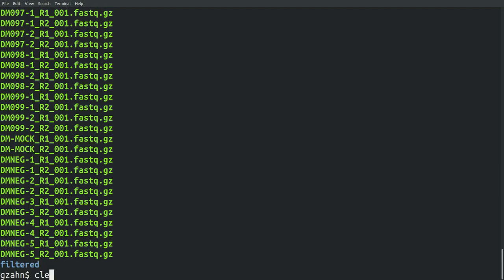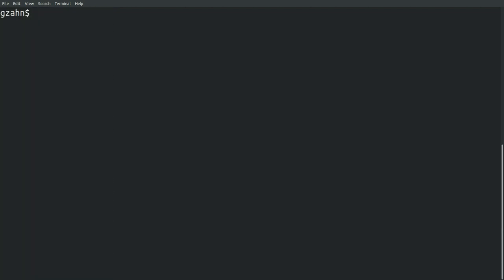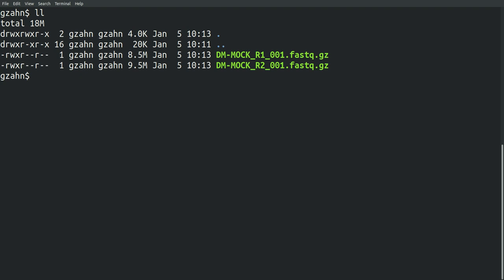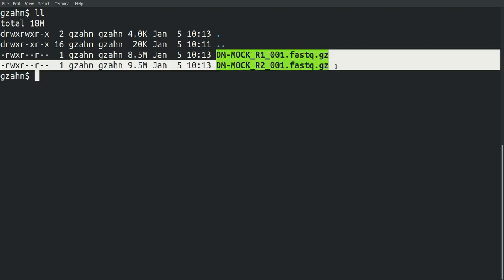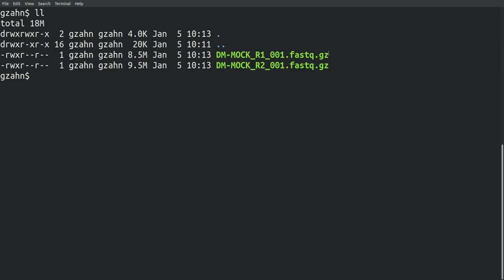If I just look around, I've got one sample here, both reads. This is .fastq.gz. Let's first talk about the gz. That stands for gzipped. That's a compressed file.